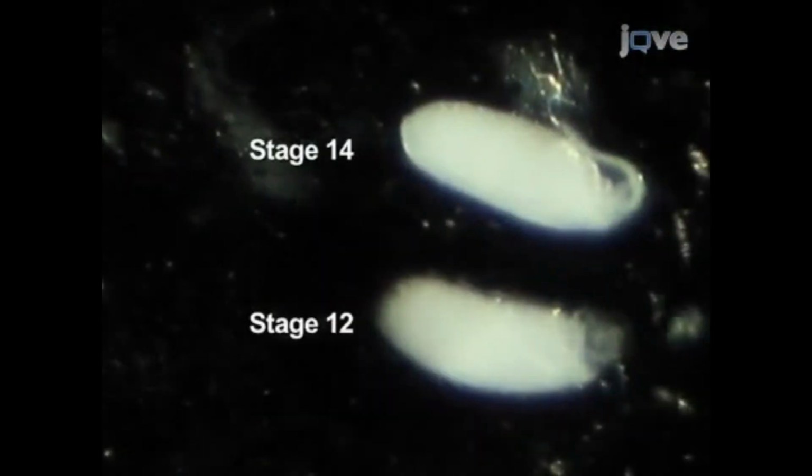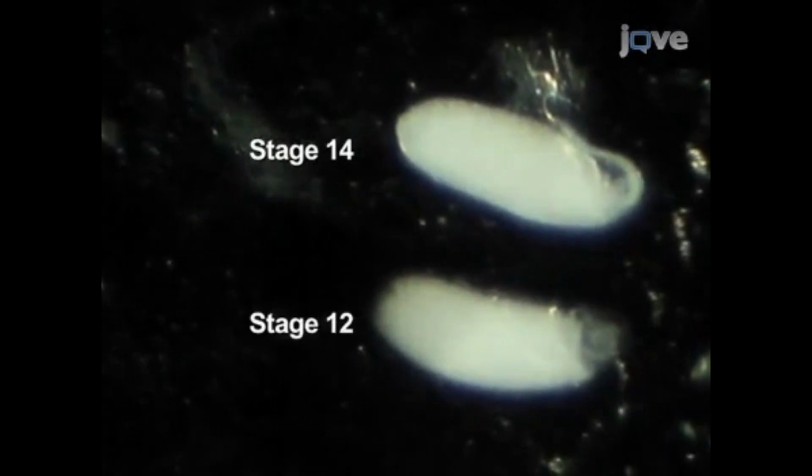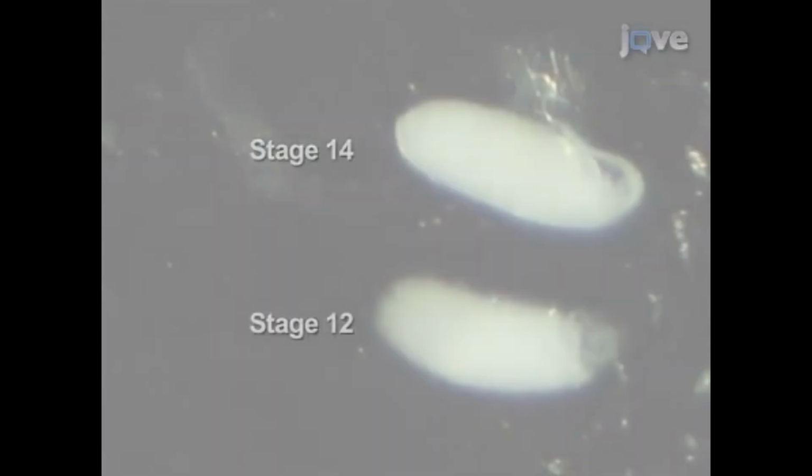Repeat this step until the ovarioles are spread out on the cover slip. When egg chambers are no longer stacked on top of each other, this step is complete. Using a dissecting probe, separate the late-stage egg chambers to facilitate imaging. To position stage 14 egg chambers, use forceps to grasp their dorsal appendages.